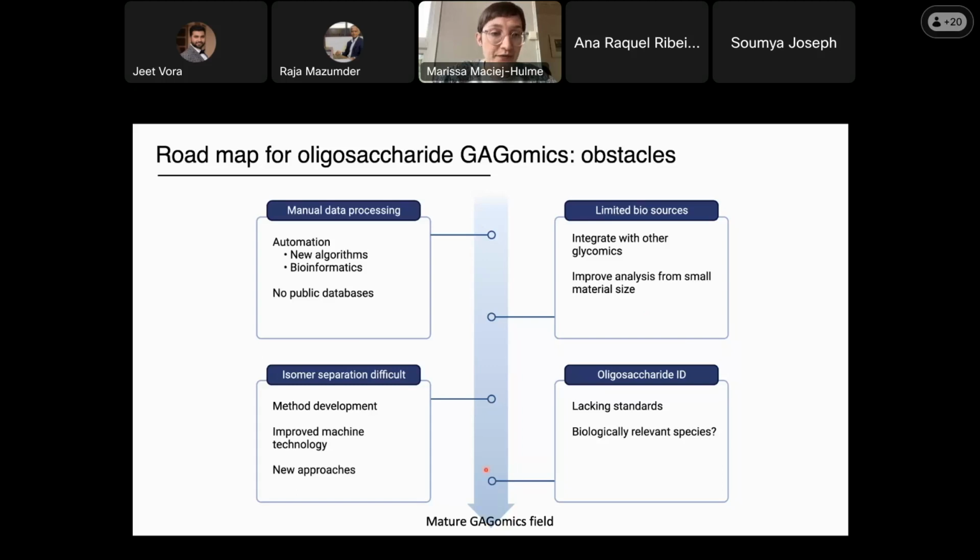Further down the line, it will be necessary to continue solving isomeric issues of mass spectrometry, as currently their separation is tricky and very specialist. And the generation of oligosaccharide standards will also need to be completed. Their availability is limited, mainly because we don't know which standards to make. So improvement in the biosources and data generation should help guide which standards will be important to synthesize and implement routinely for particular analyses.